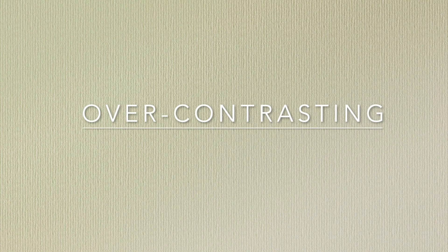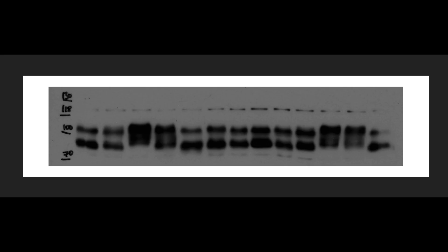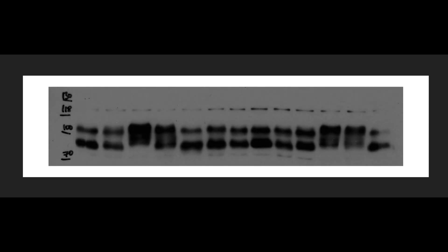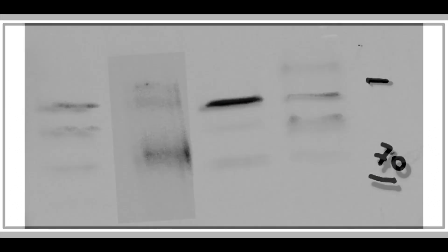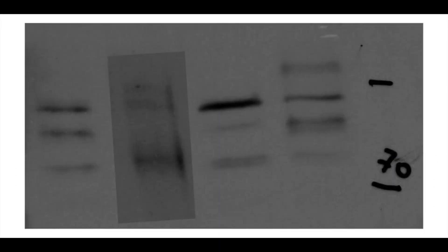A frequently encountered problem associated with immunoblots and gels is over-contrasting. Adjusting the contrast in moderation is acceptable if it is applied equally across the entire image and equally to controls. However, the contrast should not be adjusted to an extent where data disappear. Background noise should always remain visible and not be wiped out. Take note that over-contrasting can also be used to hide a number of inappropriate data alterations, such as splice marks or dropping in of elements.